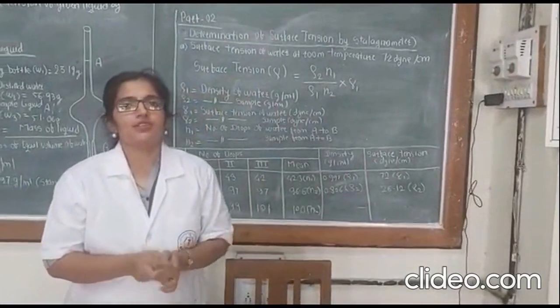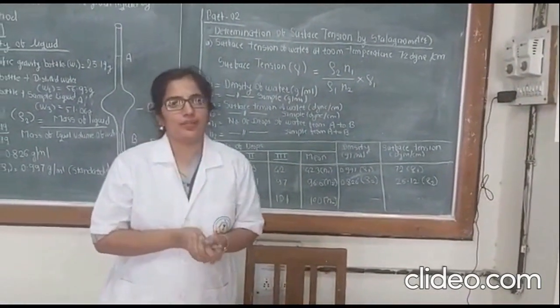That is the determination of surface tension by the drop count method.